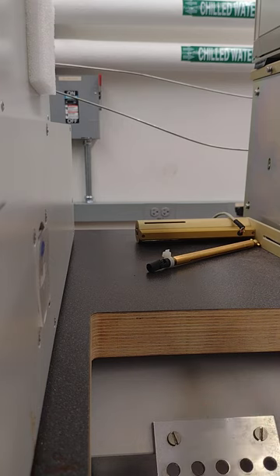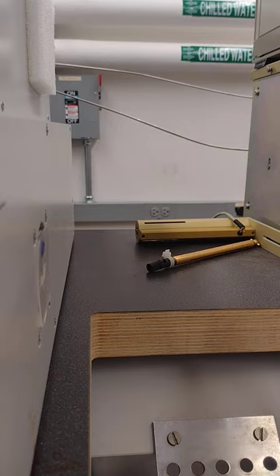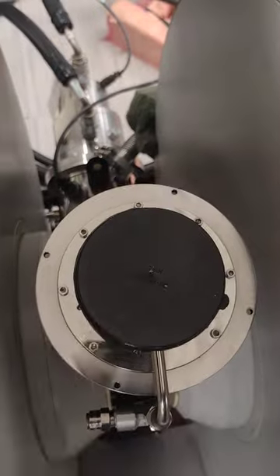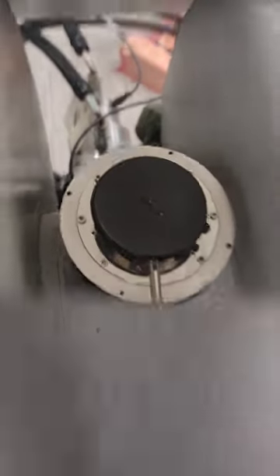Whenever you're trying to manhandle this cryostat out from its little cubby in here.